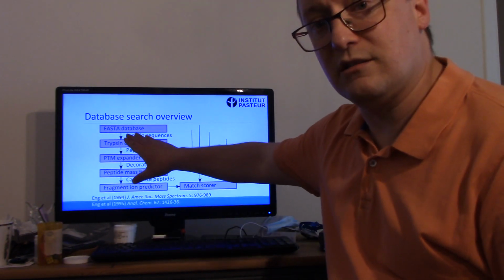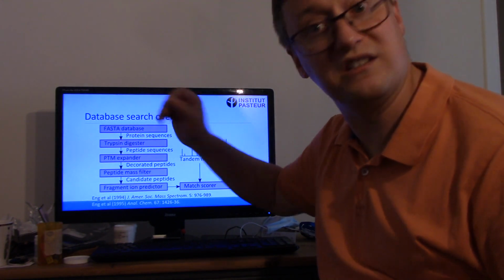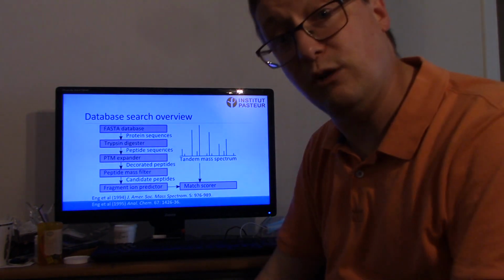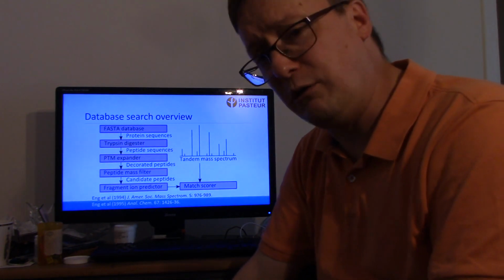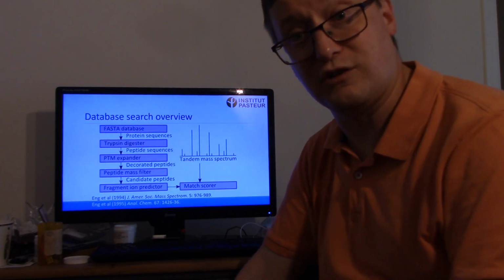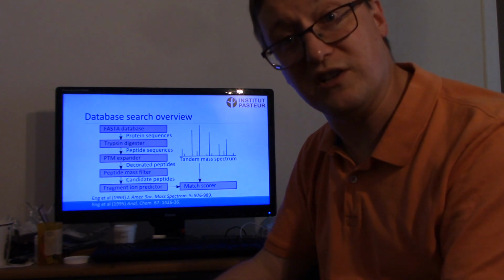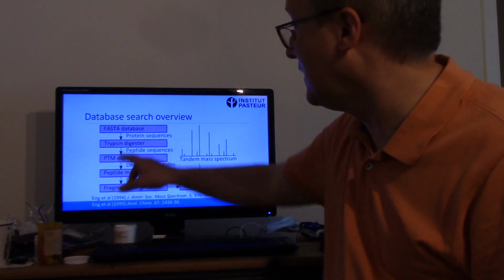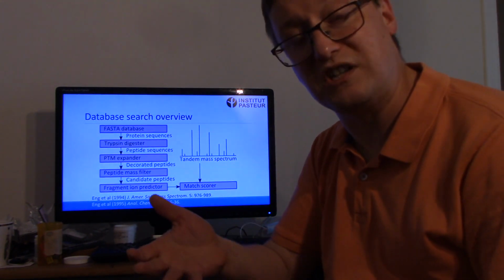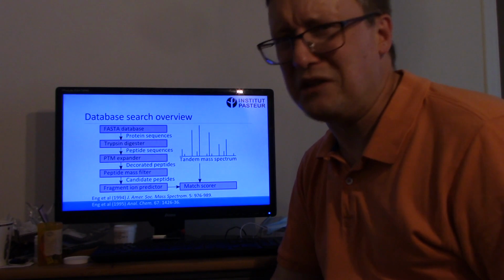In this case, we're going to be spending a lot of time talking about a sequence database, thus the database search method. FASTA sequence databases were not actually created for proteomics. They were created for homology search, for recognizing which protein sequence has been seen previously in the sequence databases. Now, in this case, we're not using the FASTA algorithm, we're just using the sequence databases formatted in that way. And it's not much of a database, frankly.